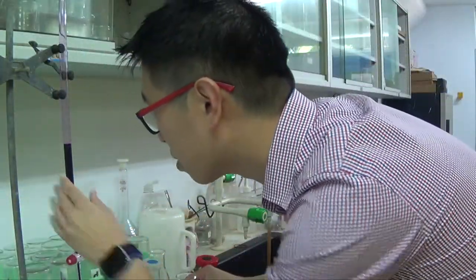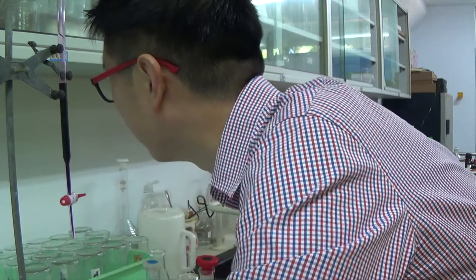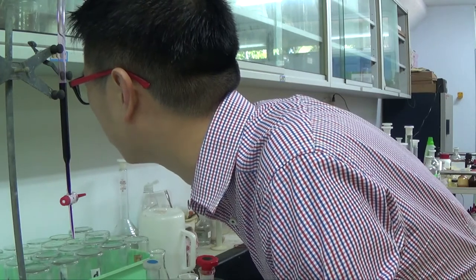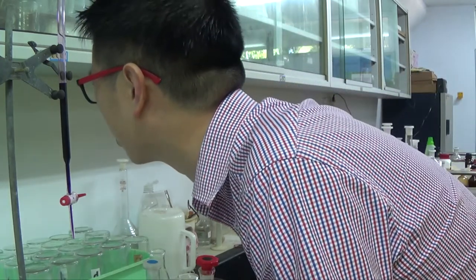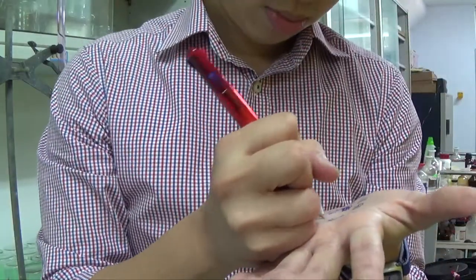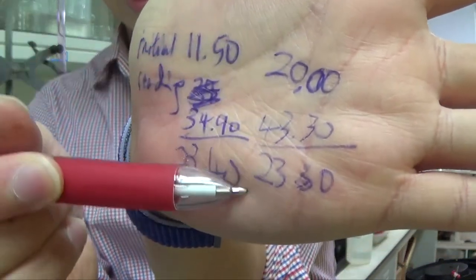If I read my volume, I should leave it up so that I'm reading at eye level. Read above the meniscus, just like I've read above the meniscus for the initial and other readings, only because it's a dark color solution. This is 43.30. And I get 23.30 as a result. So 43.30 minus that, I get 23.30.